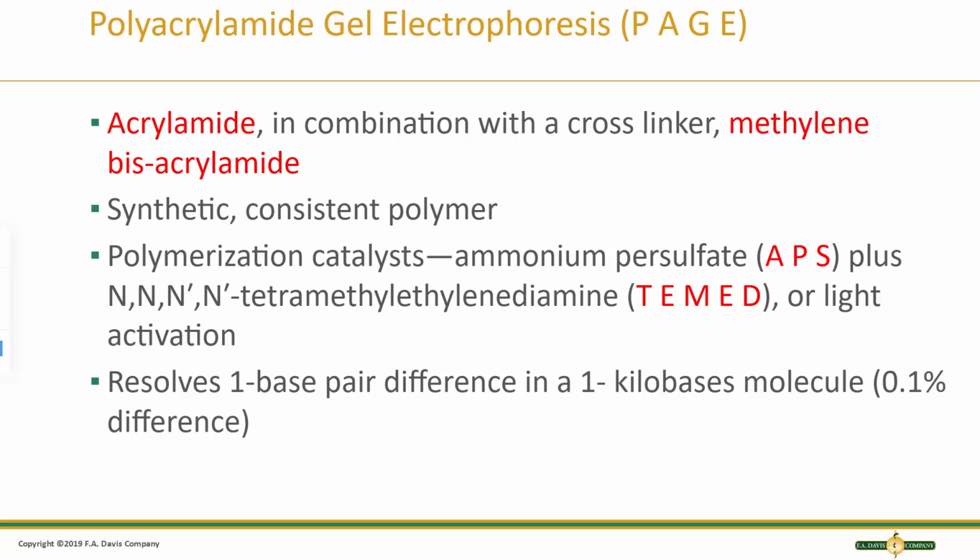Polyacrylamide gel electrophoresis, or PAGE, is usually used for separation of proteins. So if we're going to do a protein separation, we typically do this, but it can be used for DNA occasionally. So with PAGE gels, typically we have SDS as the main buffer, so that becomes an SDS PAGE gel electrophoresis. With proteins, now if you remember from biochemistry class, proteins are made up of amino acids.